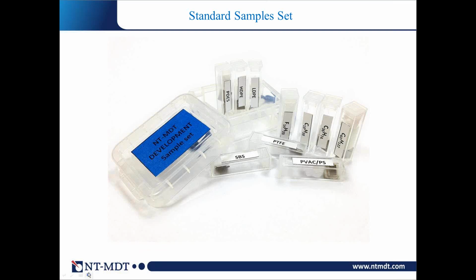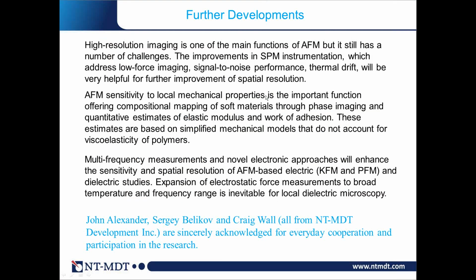I was telling about several things. About high-resolution imaging, we still have room to go further and get to true atomic resolution, which, in my subjective view, I believe we have not achieved yet.